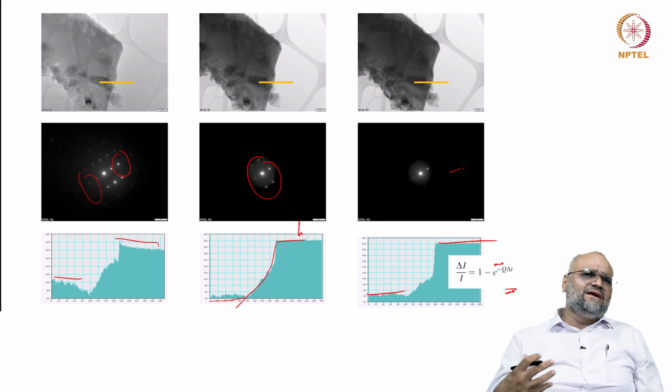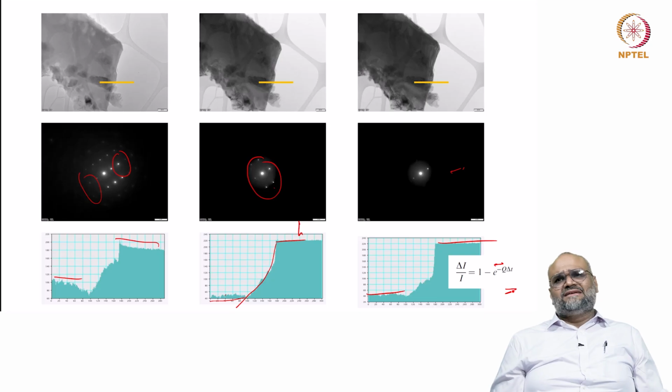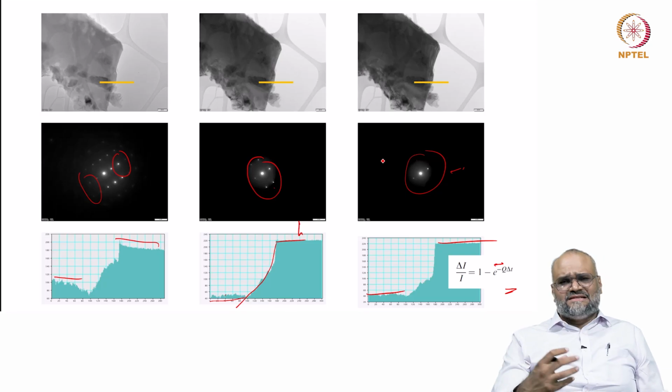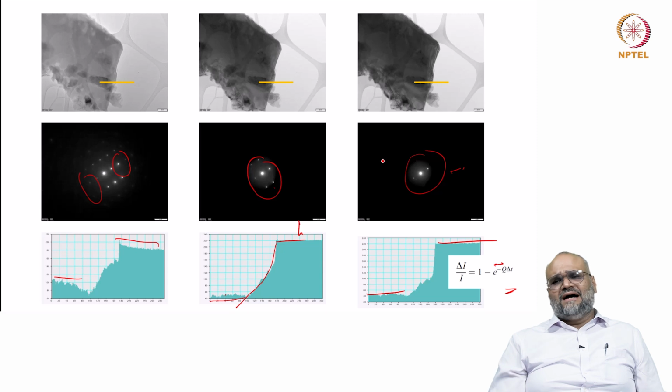So, once you orient a specimen in the zone axis and you want to obtain high resolution imaging, you do not want to use any of the apertures to block the higher order frequencies, to obtain a very good high resolution image. But when my intention is to image defects or to improve the contrast of the features that I want to see, then I intentionally use an aperture, and this is called switching between the bright field and dark field images.